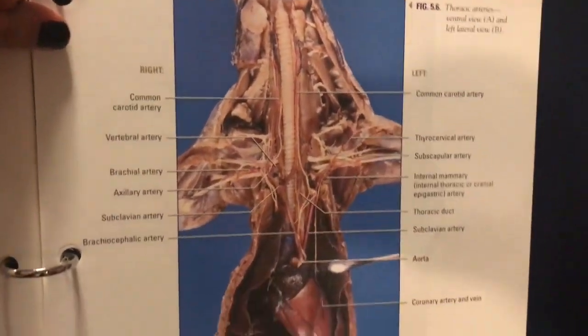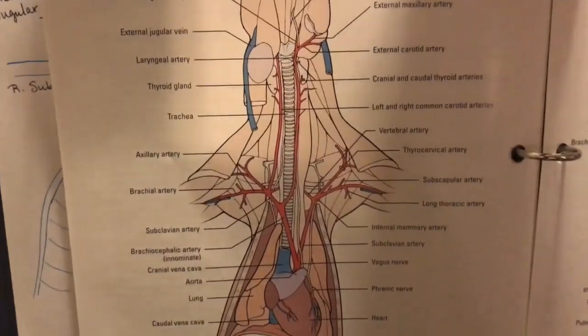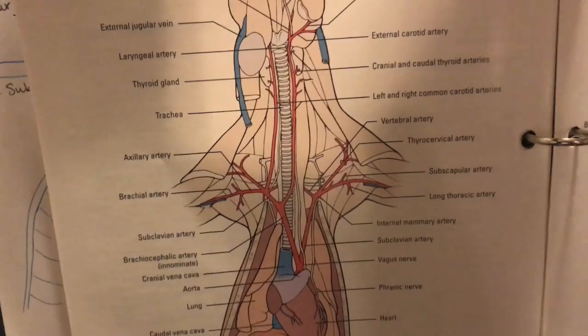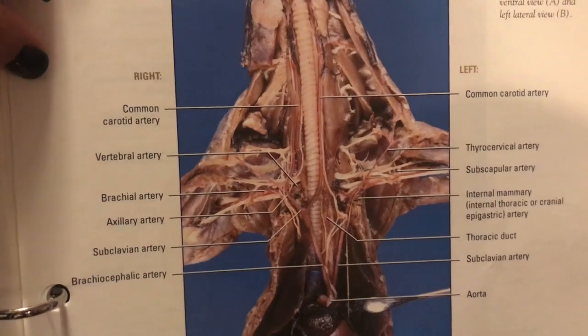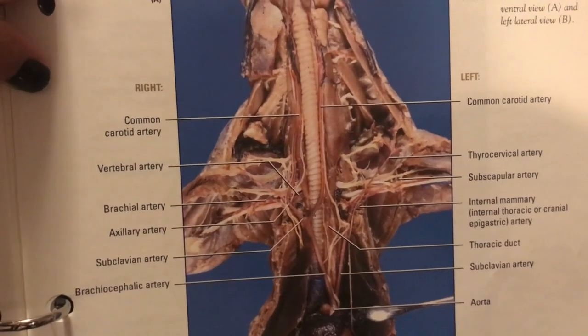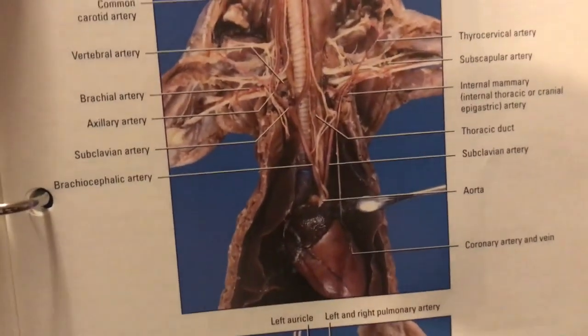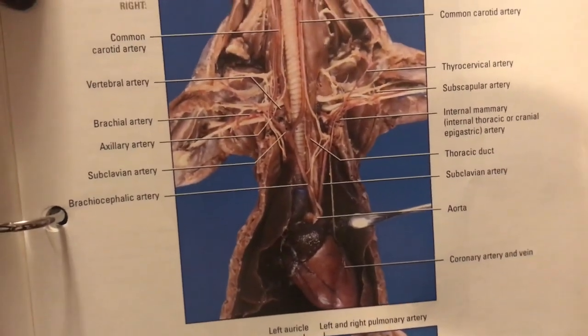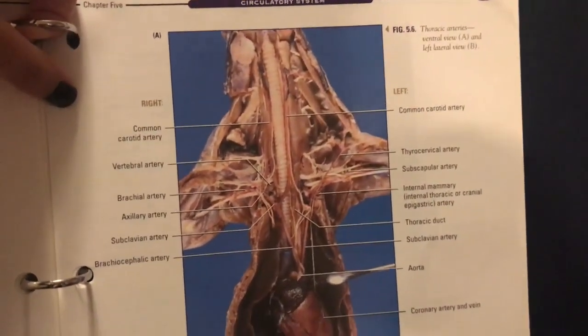Page 63 has a great photo of a dissected Mink, and then page 62 has another diagram that you could look at and mimic drawing. So this one's really good for being able to see how those arteries wrap around and orient themselves around the trachea and come off of the aorta, and where they lie in the cranial and thoracic cavities.